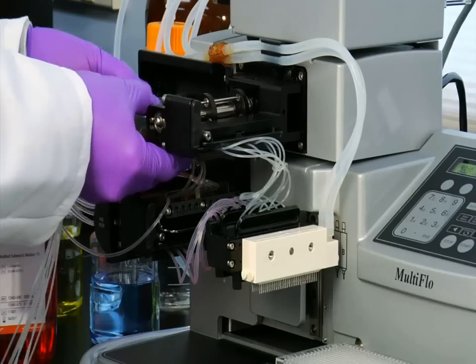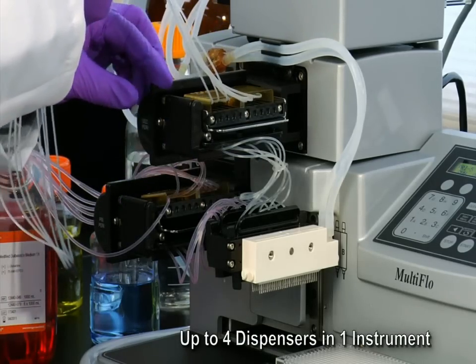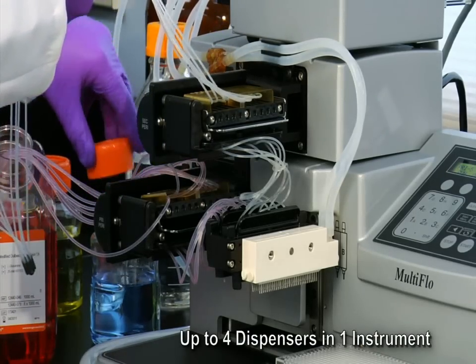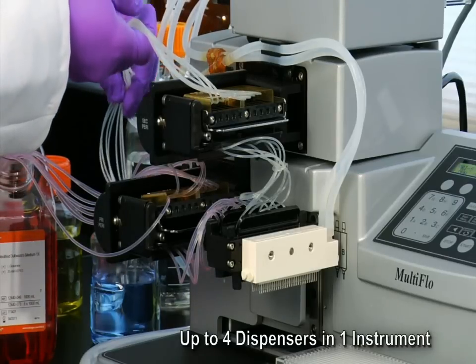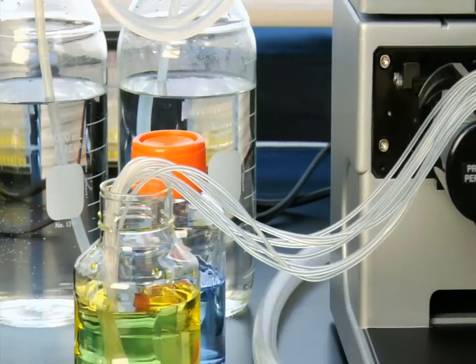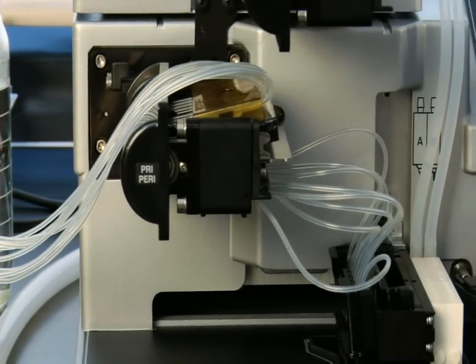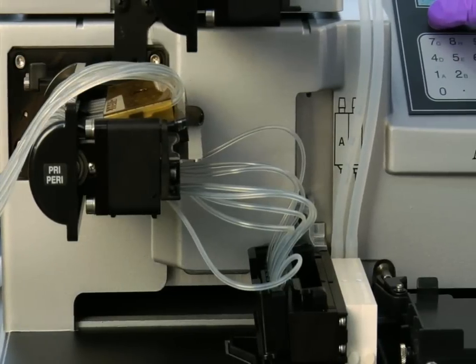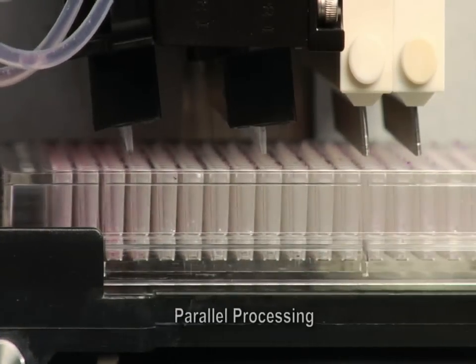With fewer instruments to purchase, customers save money along with time and maintenance. Multiple reagents in one instrument save space, conserving a laboratory's precious benchtop space and improving efficiency within robotic systems. Typical systems have 2 to 4 dedicated dispensers — the Multi-Flow can replace all of these, simplifying complex processes and giving assay automation specialists flexibility that previously was not available.